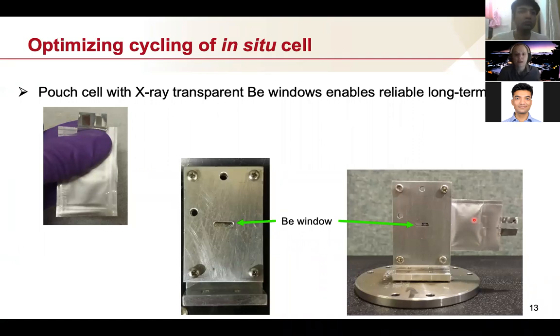And I'll specify that depending on the material. So in situ, I would say it's sort of broad. I try to use operando if it's really operating. We use a mix of in situ, ex situ, operando, depending on what's best for the amount of time you have and the questions you want to answer.